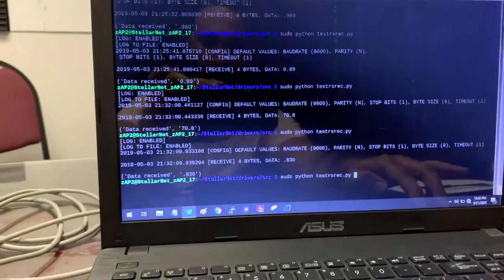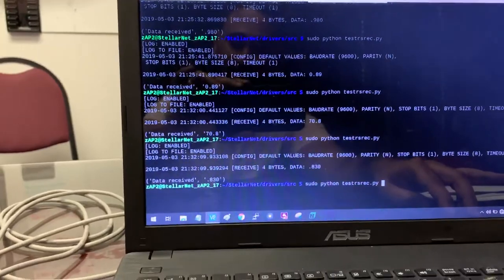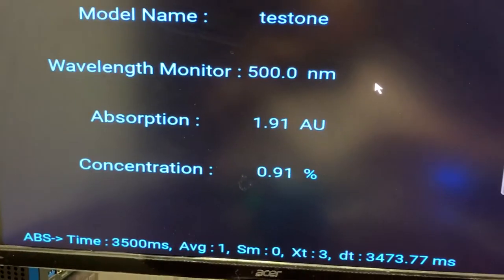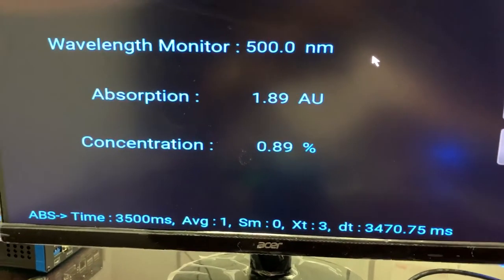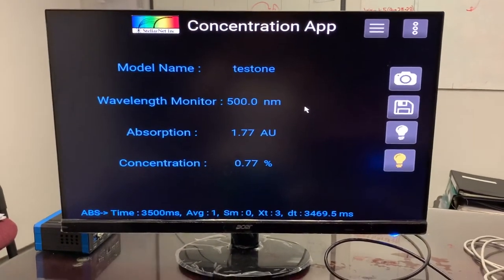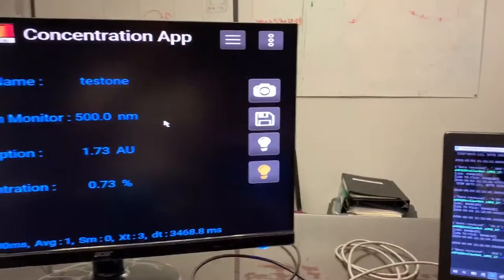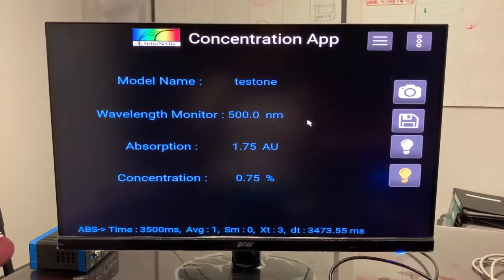And over here it keeps changing because it's running in real time. This script is just a demo script. You can modify the script to read continuously through a while loop or a for loop, if you will. The data from the master is continuously saved, continuously running, and continuously being sent. Again, you have been provided with the source code, and you can change the speed of the data if you would like to send it in a different loop, and you can synchronize your master and slave time cycles so you don't get corrupted data.